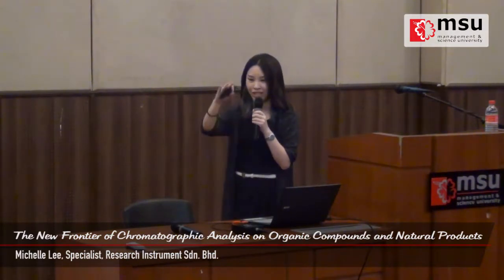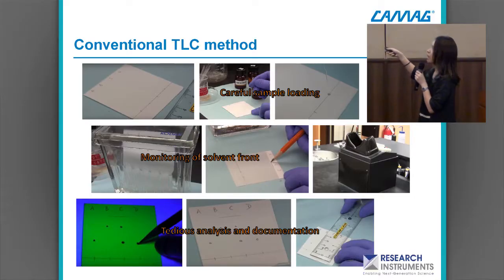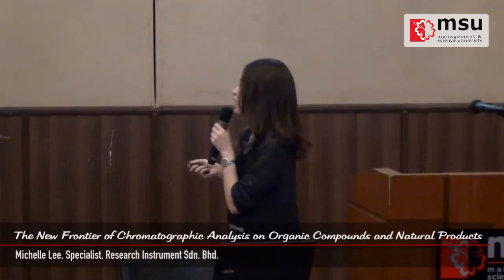Yeah, so this is what I did. You all just sit in front and wait, looking at it, because we don't want to overdevelop our plate. If the solvent front goes all the way up, all your compound might be out of the plate. So it actually requires some monitoring.